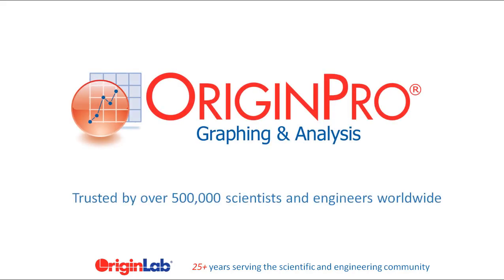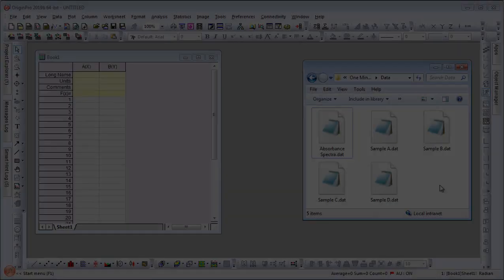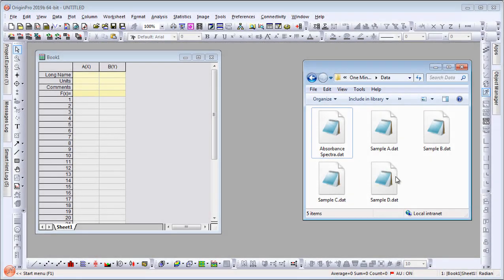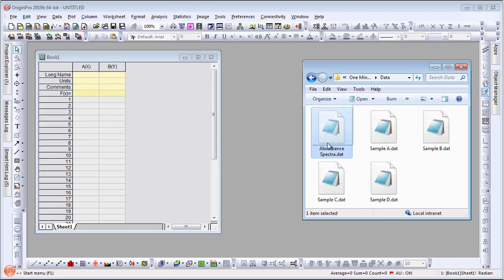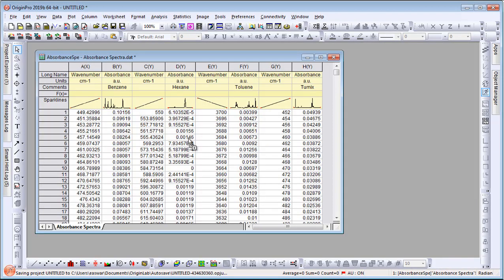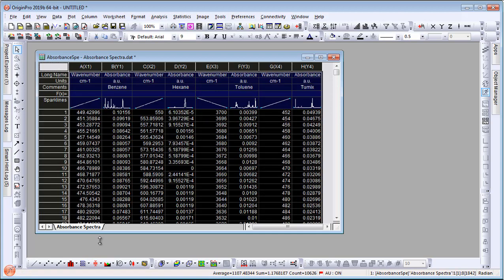Origin is a graphing and analysis software trusted by over 500,000 scientists and engineers worldwide. There are many ways to bring your data into Origin. The easiest is to drag and drop a file onto a blank Origin worksheet.